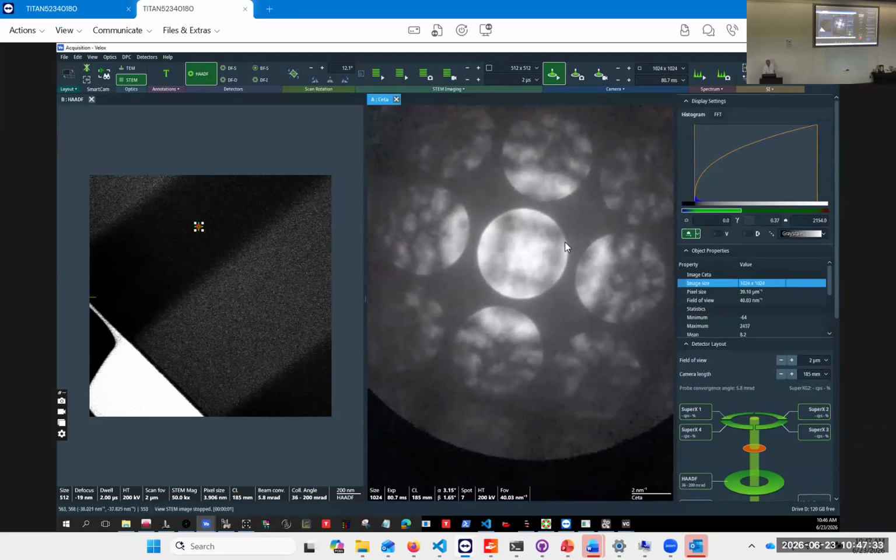Again, we see the blobbiness of that pattern and how well these structures in the disks are related. If there's any kind of tetragonal distortions, then you will see that immediately, because the patterns will no longer be the same left and right versus up and down. So you can directly look at these patterns and check that out.